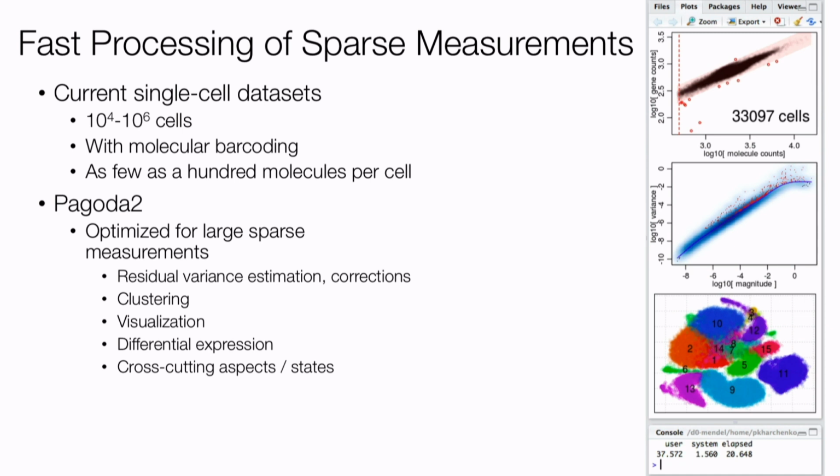Now, a key thing that we're preparing for next is that these are high-dimensional data sets, right? Altogether, across all the cells, we'll be considering about 10,000 genes, let's say. So a 10,000-dimensional space is very difficult to work with. A lot of things just don't work intuitively there. And the traditional approach is to do dimensionality reduction. But you can do dimensionality reduction in a variety of ways.